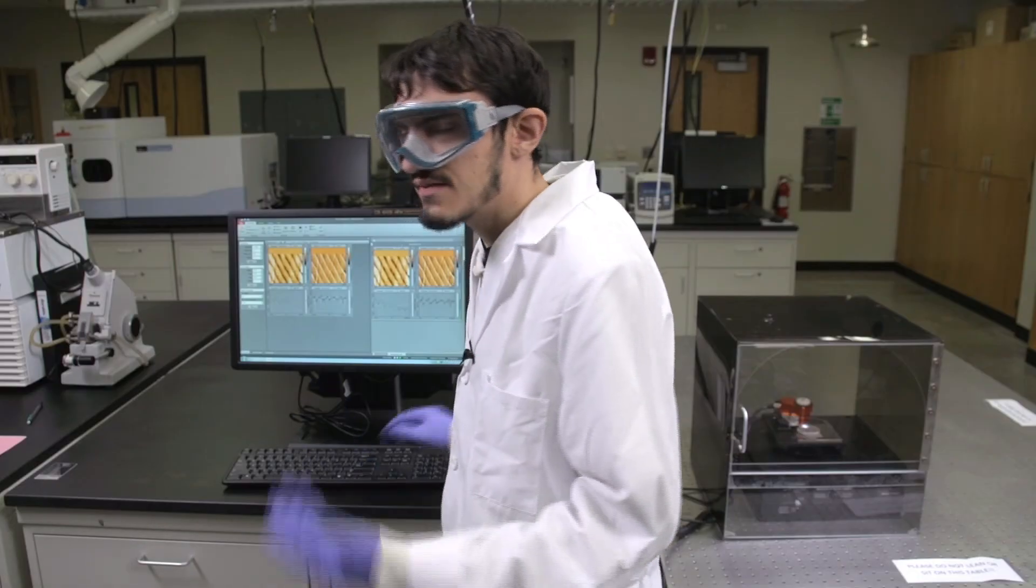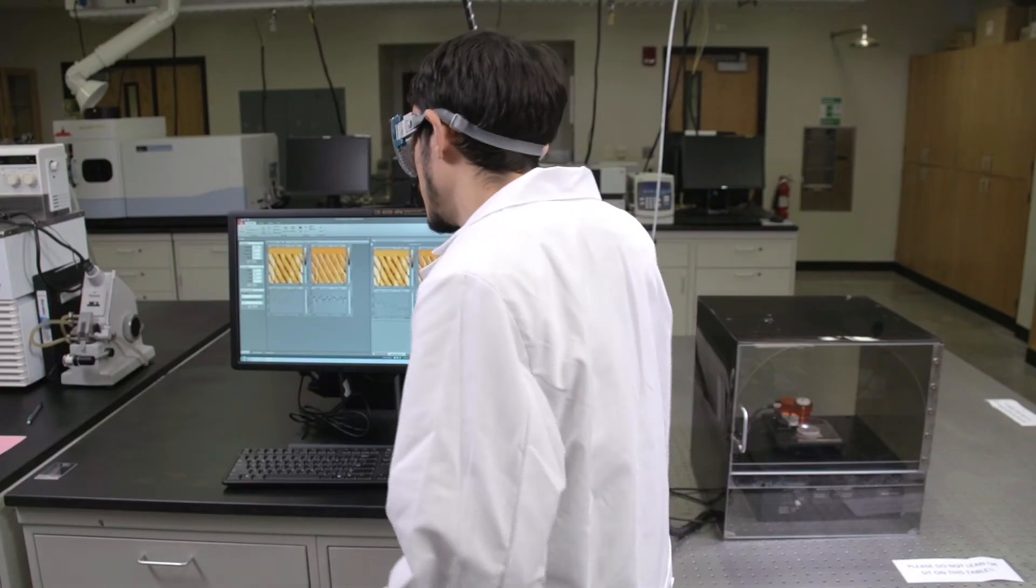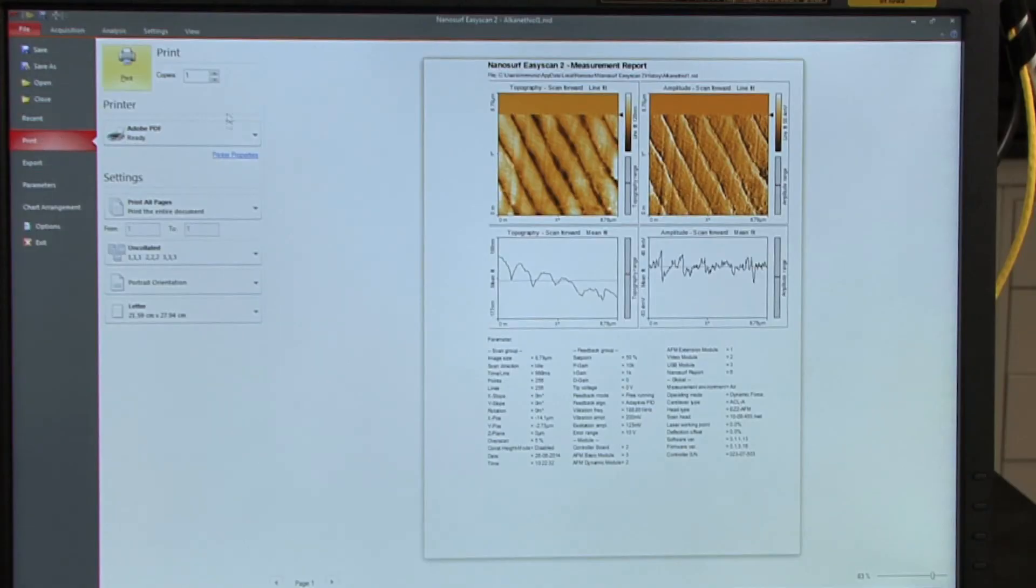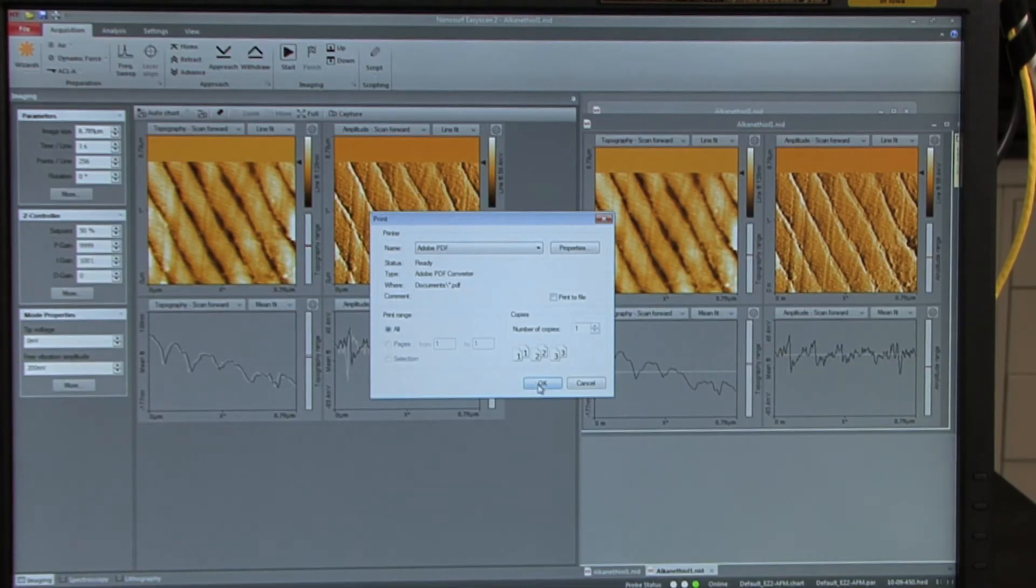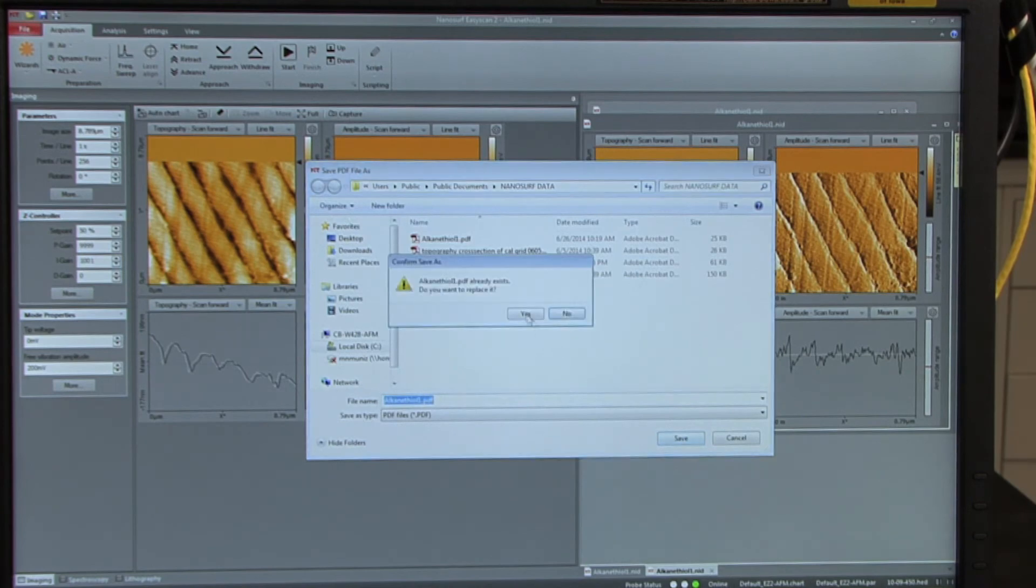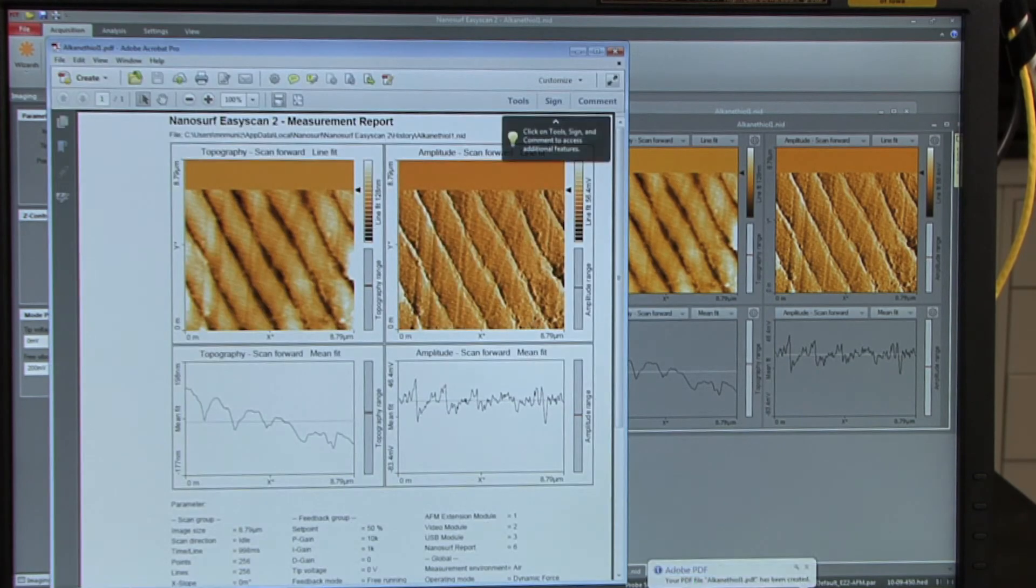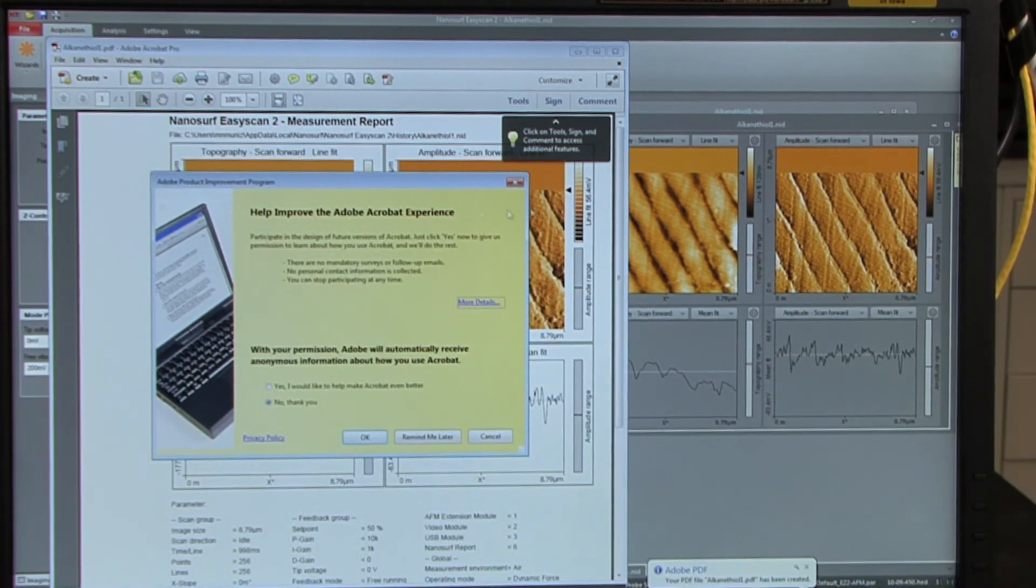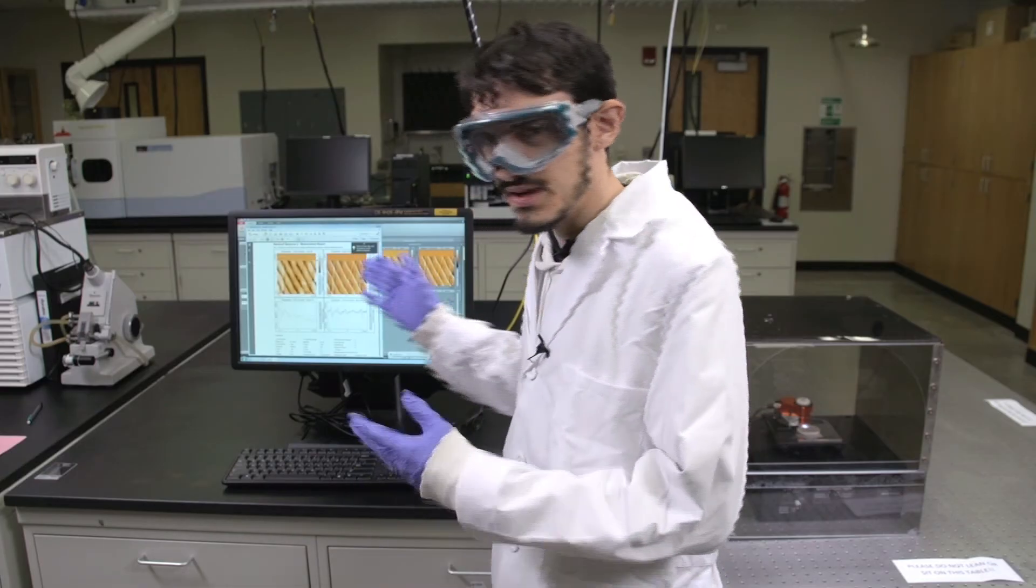Further, you can save this as a PDF as before by simply going to file, print, clicking Adobe PDF as the printer, clicking print, and you'll have all the information within a PDF.